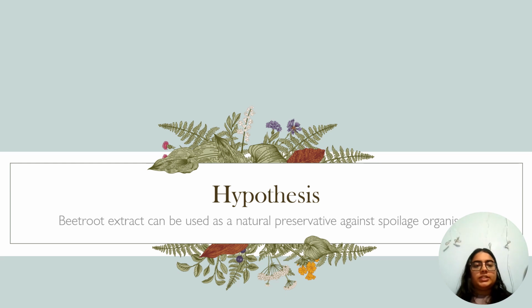The hypothesis of this experiment was to show that the ethanolic extract of Beta vulgaris is effective against common human infections in terms of antibacterial activity. It is predicted that Beta vulgaris extract has dose-dependent antibacterial activity against both gram-negative and gram-positive bacteria, and that it can be used in place of sodium and potassium nitrites to preserve meat and their products.